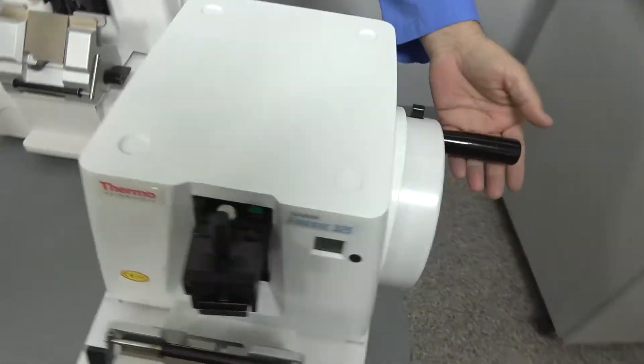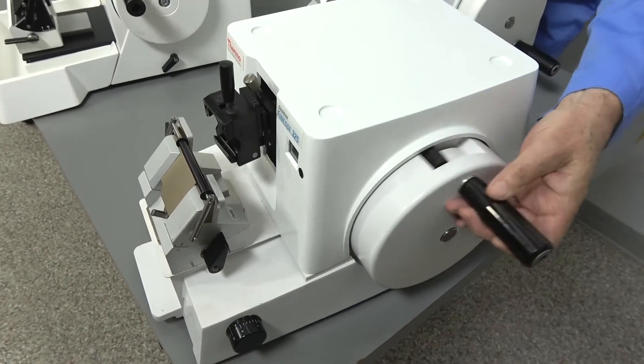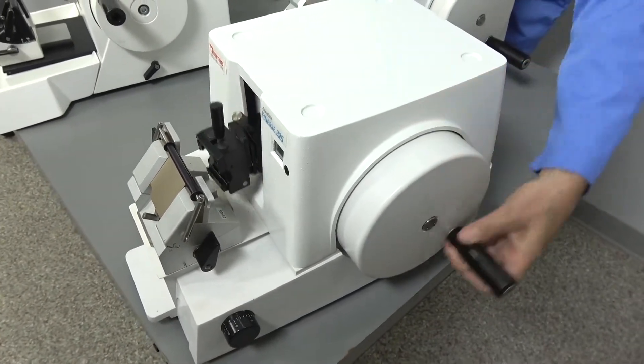And of course, being that it's non-electric, you do have to power it by hand. Great little units.